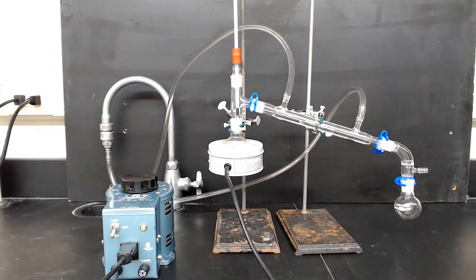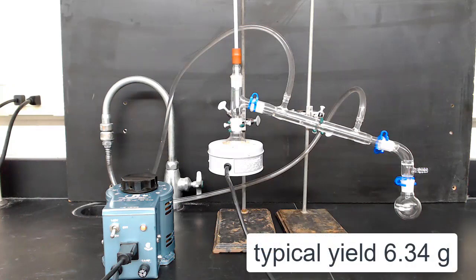Finally, determine the mass of your product and record that value in your notebook. The typical yield for this experiment is 6.34 grams.